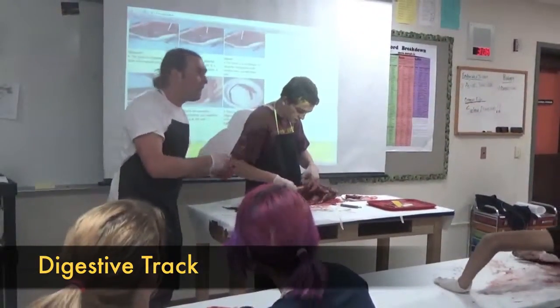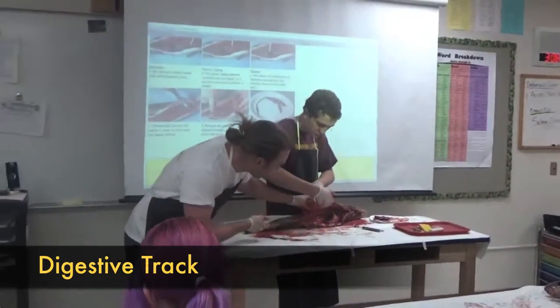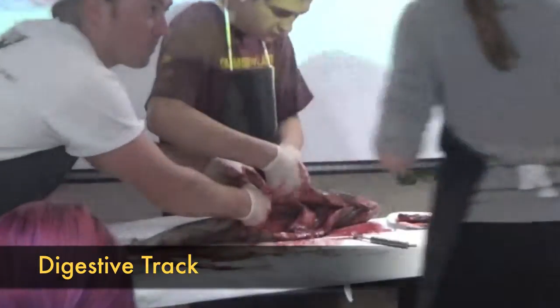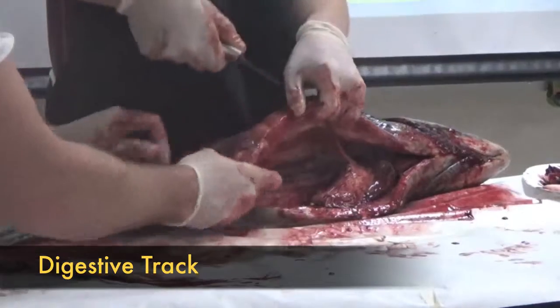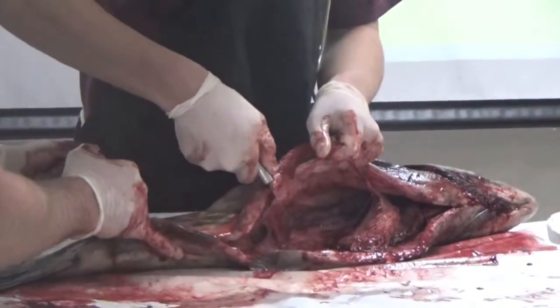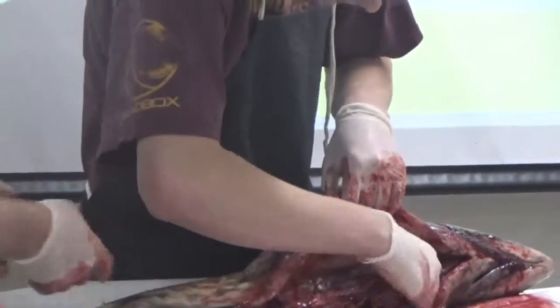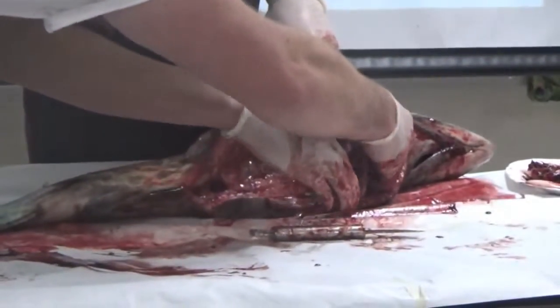Next up, we're going to be working with the digestive tract, which is this. You guys see — it's probably the last thing in front of your swim bladder. You can just kind of cut it out. We're going to cut it all the way back to where it connects to the body, where the intestines are getting close to the anus. You cut there, and then you cut towards the front of it.